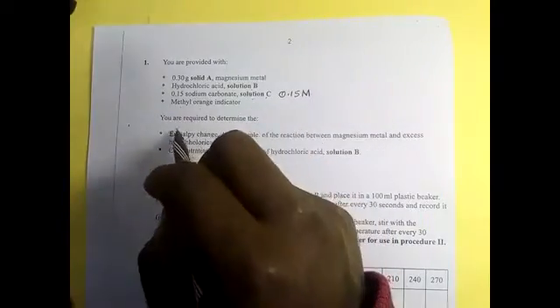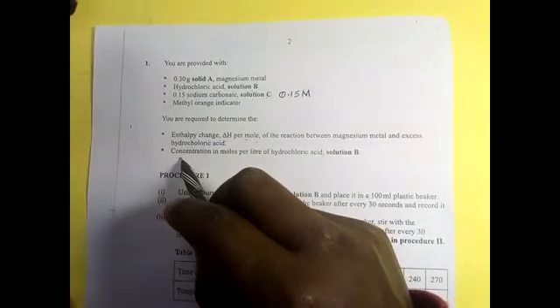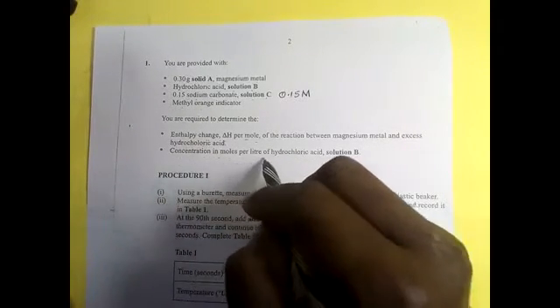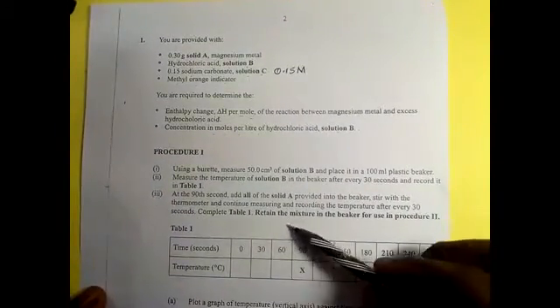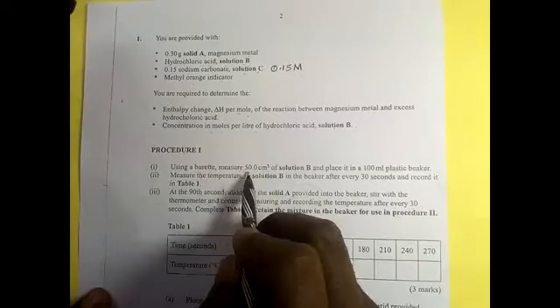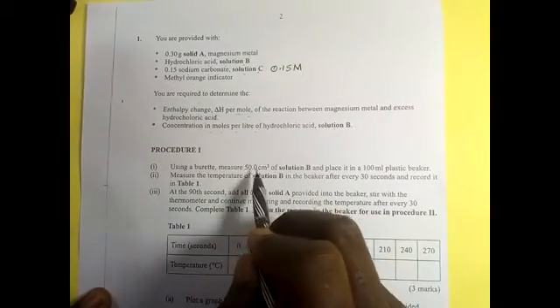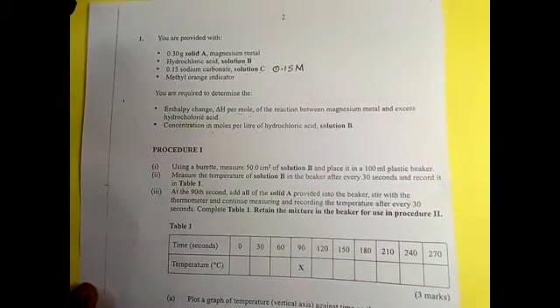What are you supposed to do? You are required to determine the enthalpy change per mole of the reaction between magnesium metal and excess hydrochloric acid, and then calculate the concentration in moles per liter of hydrochloric acid, solution B. One thing you need to know from here is that the solution B that was used was 50, but now we are not going to do procedure 1. We want to go to titration first.